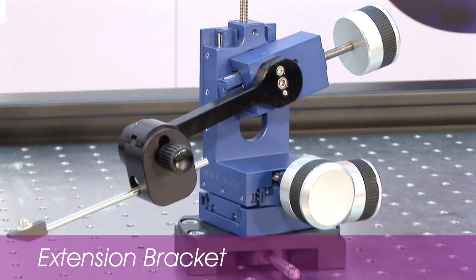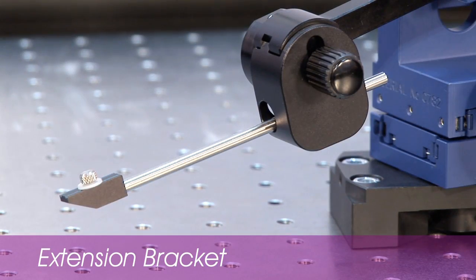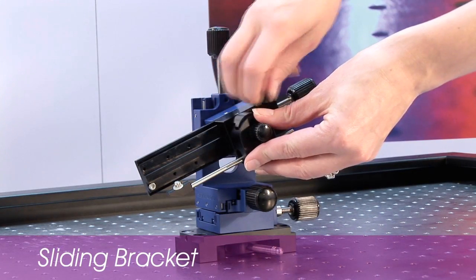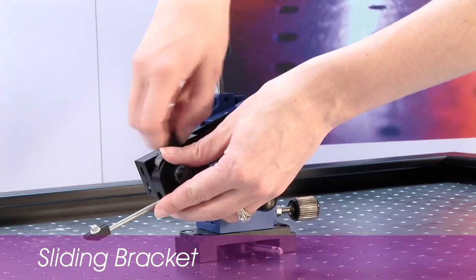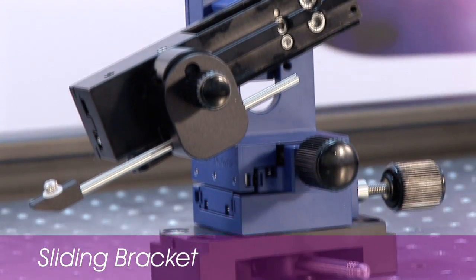The LBM7 extension bracket provides the freedom to position your electrode or pipette in difficult places while maintaining absolute stability. The sliding bracket has an additional 75 millimetres of travel to allow you to slide the pipette in and out of the recording area. The mechanical stops ensure repeatable positioning and easy pipette exchange.